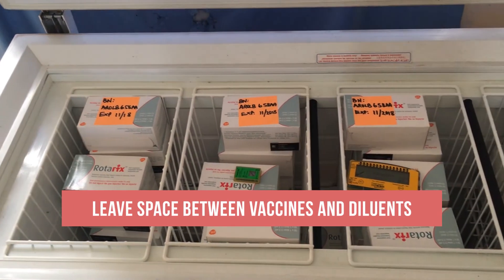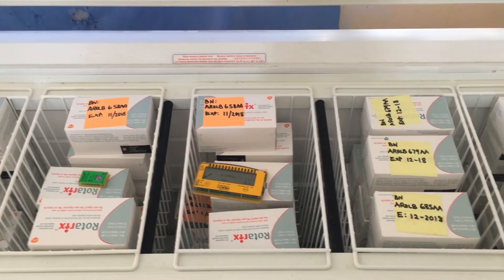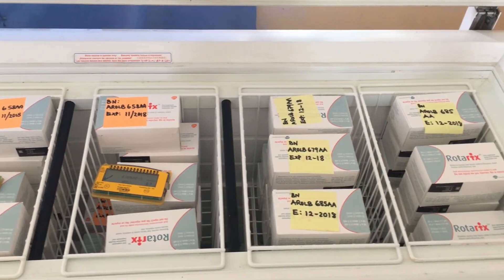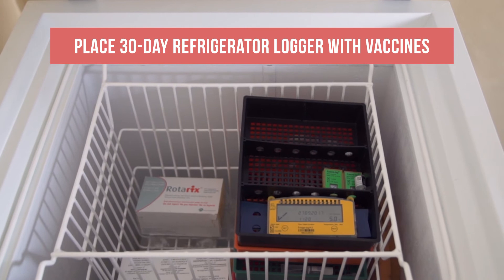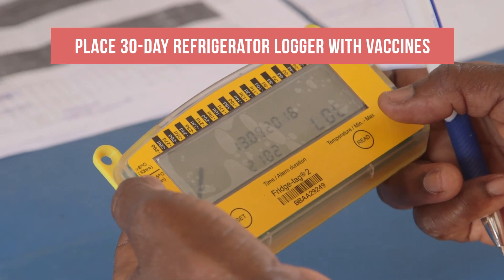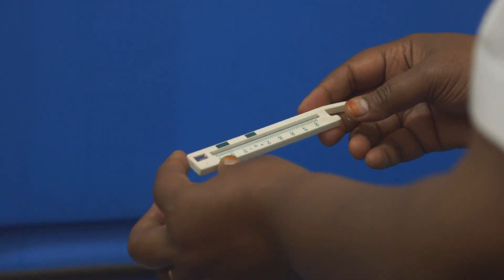Notice the space between the vaccine and diluent containers. This lets air circulate between them and keeps them cool. There is also a 30-day refrigerator logger placed with the vaccines. Your facility may use a freeze indicator and thermometer instead.